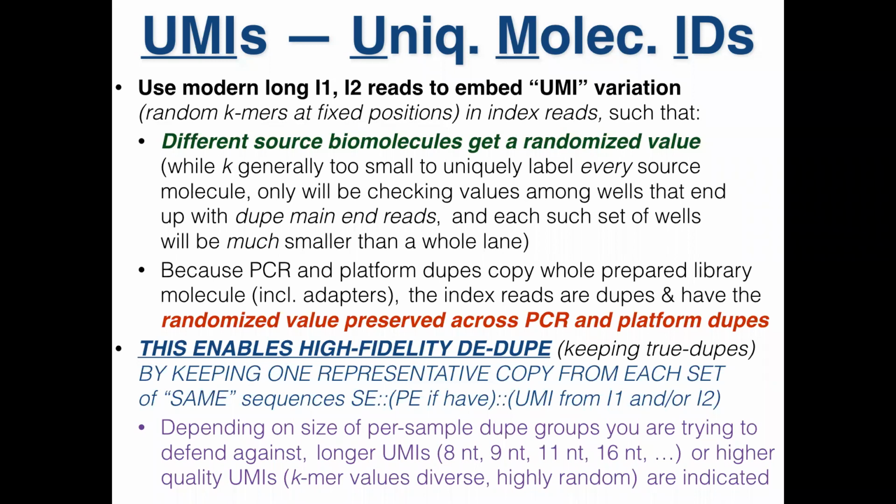Now, you probably don't have enough UMIs to make them all distinct. How many biomolecules did you pull out? Well, if you're starting from a lot of material, some fraction of Avogadro's number, that's the number of molecules you have, and it's enormous. And what's a long UMI? We can buy 4 to the 10, that's a million. So you only have a million labels for your biomolecules, so there will be duplicates.